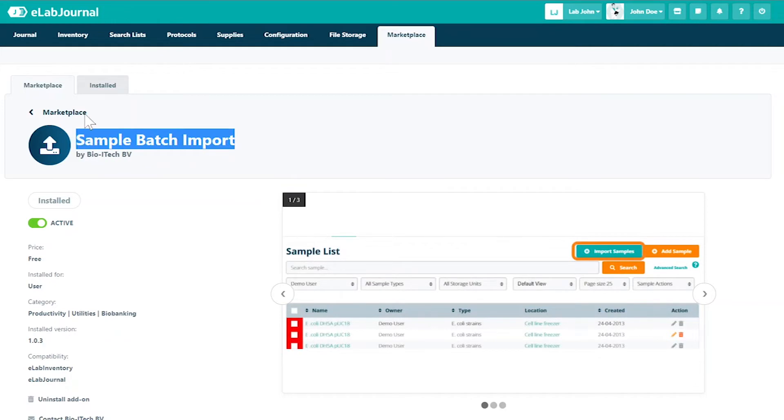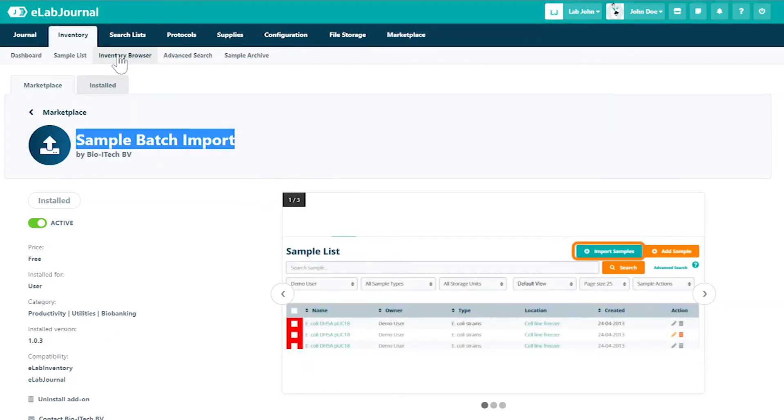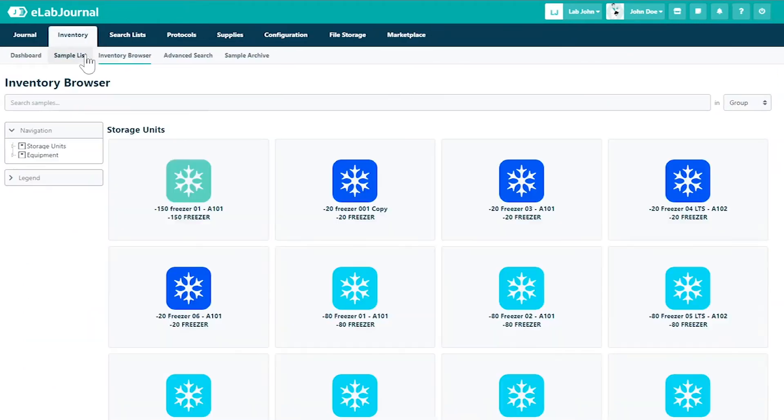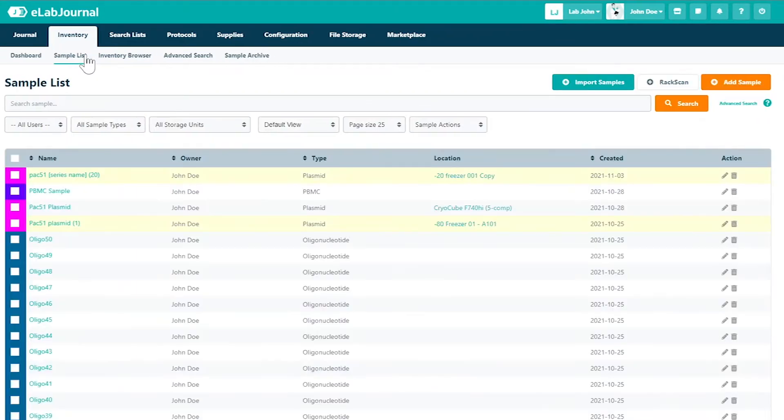In this case, Sample Batch Import is used to import samples in batches for improved productivity and is found in the sample list.